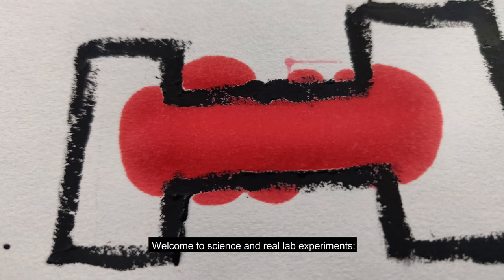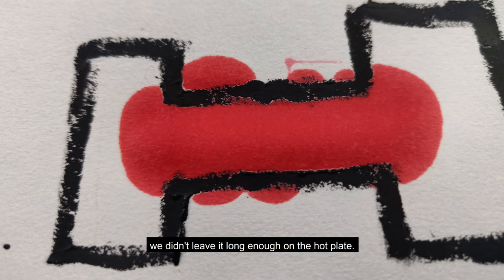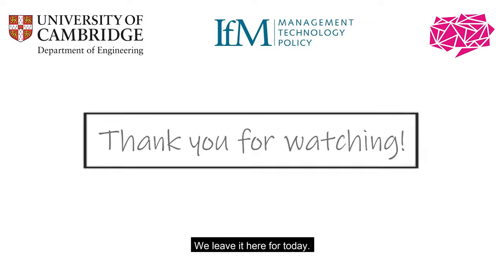Welcome to science and real lab experiments. They never work on the first try. But we know the problem. We just didn't leave it long enough on the hot plate. Easy to solve. We leave it here for today.